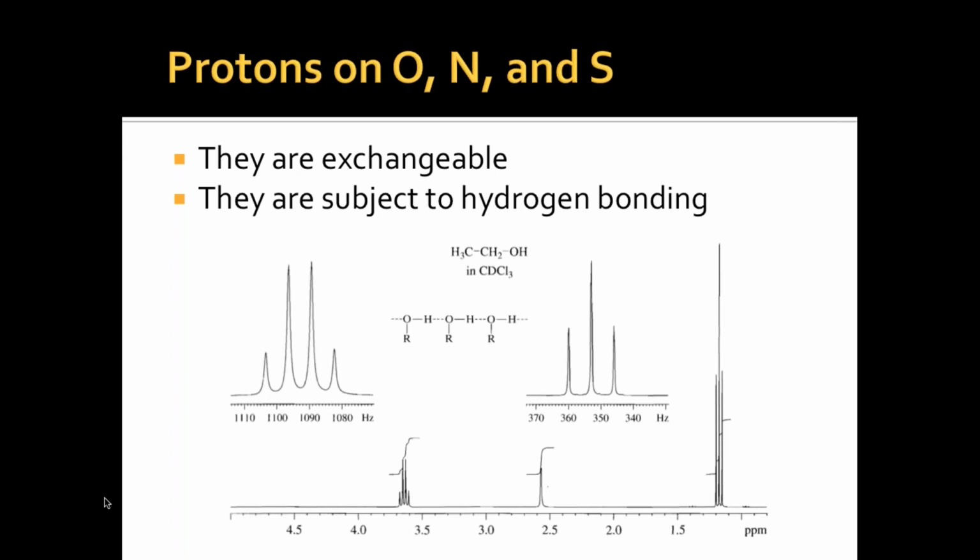So what is the effect? Let's see this. Now there is hydrogen bonding with the solvent, the partner for the hydrogen bonding. So here is the structure of CH3CH2OH, you have CH2 and CH3.